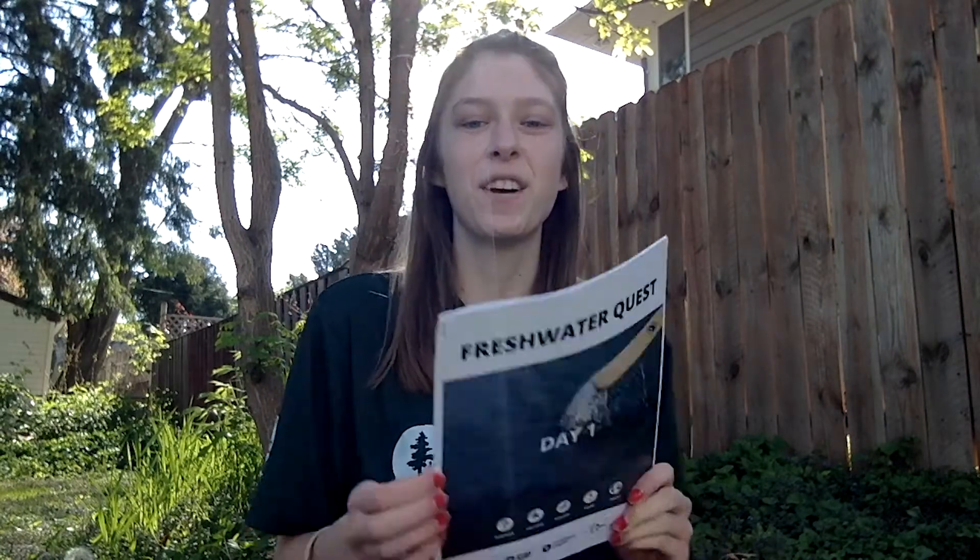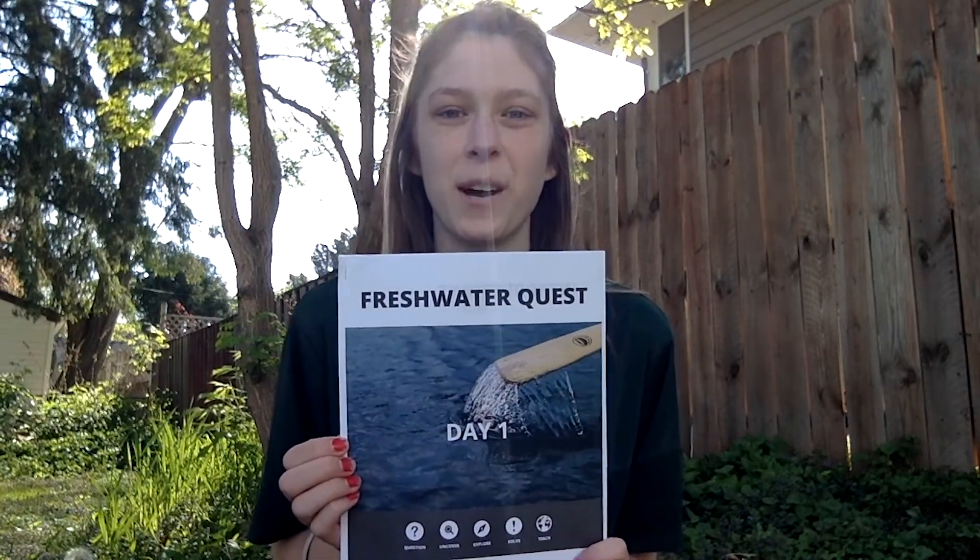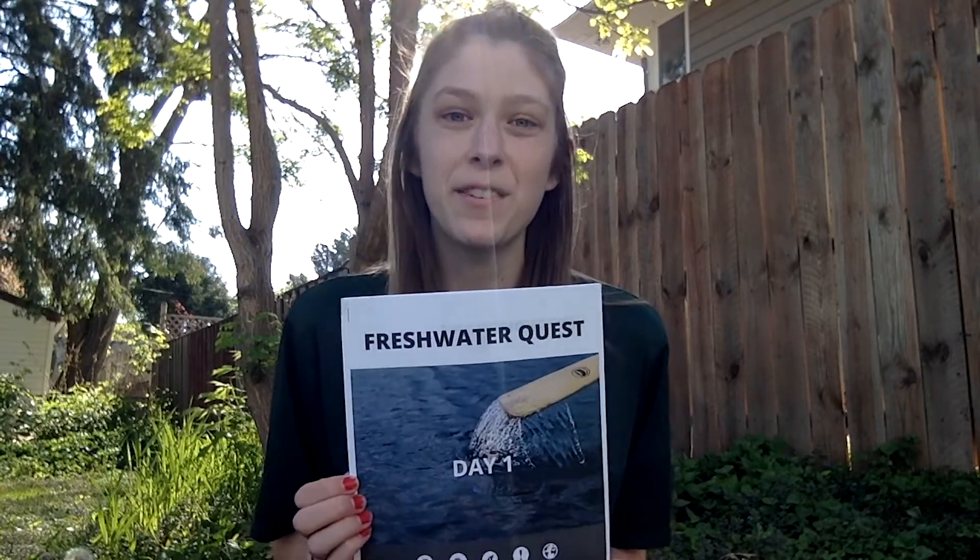Hey everyone, my name is Shelby and I use she/her pronouns. I work for Wilderness Inquiry and today I'm going to show you how to complete the pH water quality testing activity. You can find the directions in your day one Minnesota Freshwater Quest activity packet. Feel free to follow along.